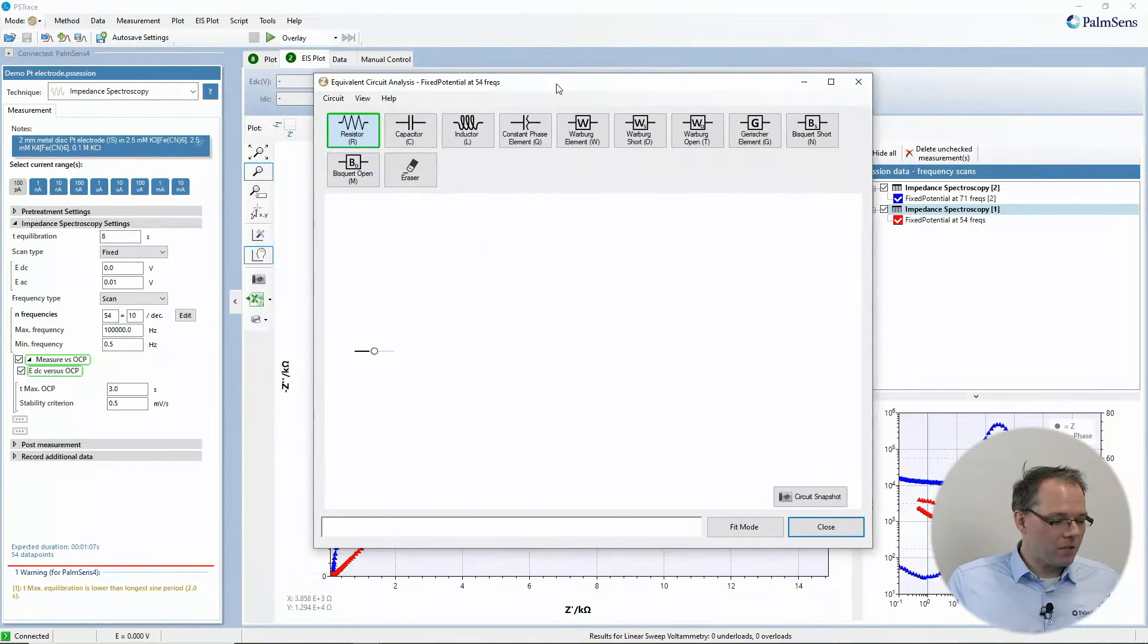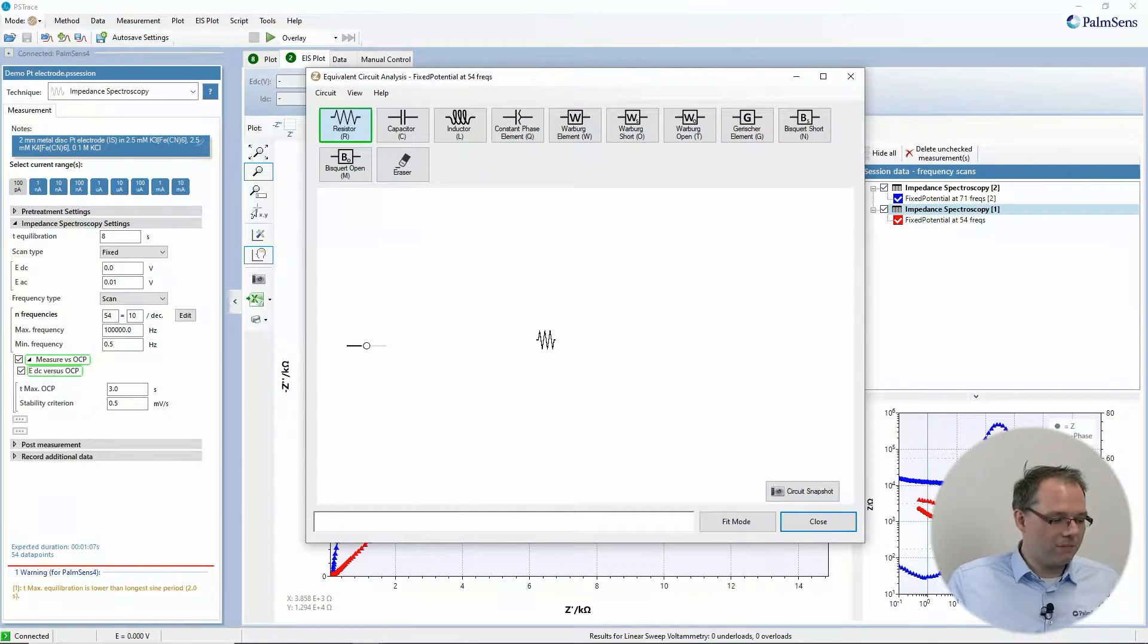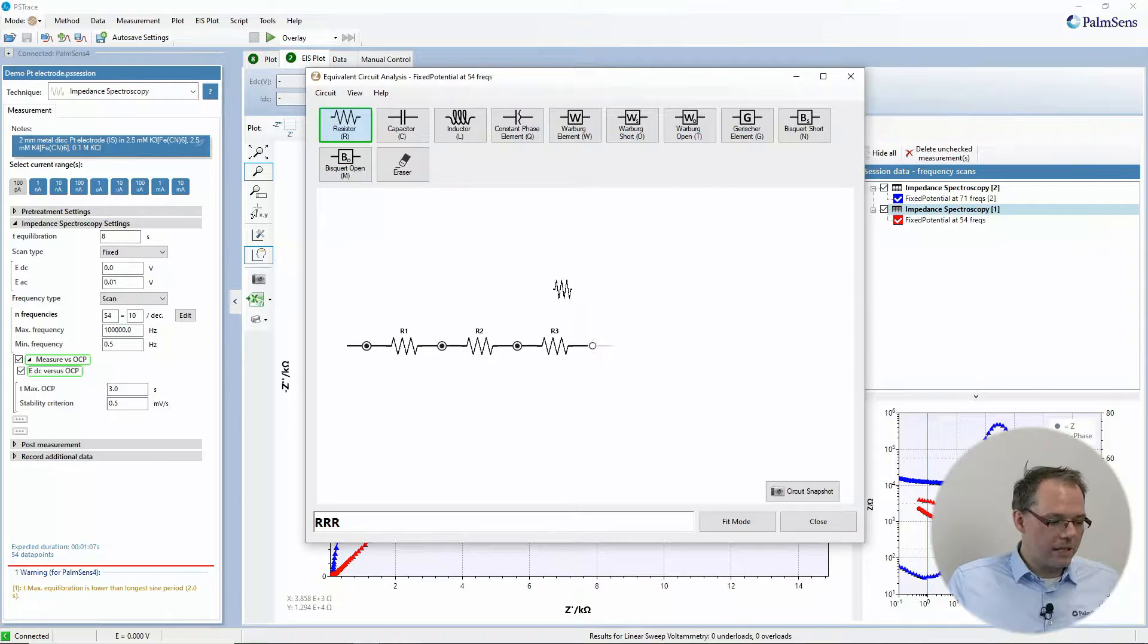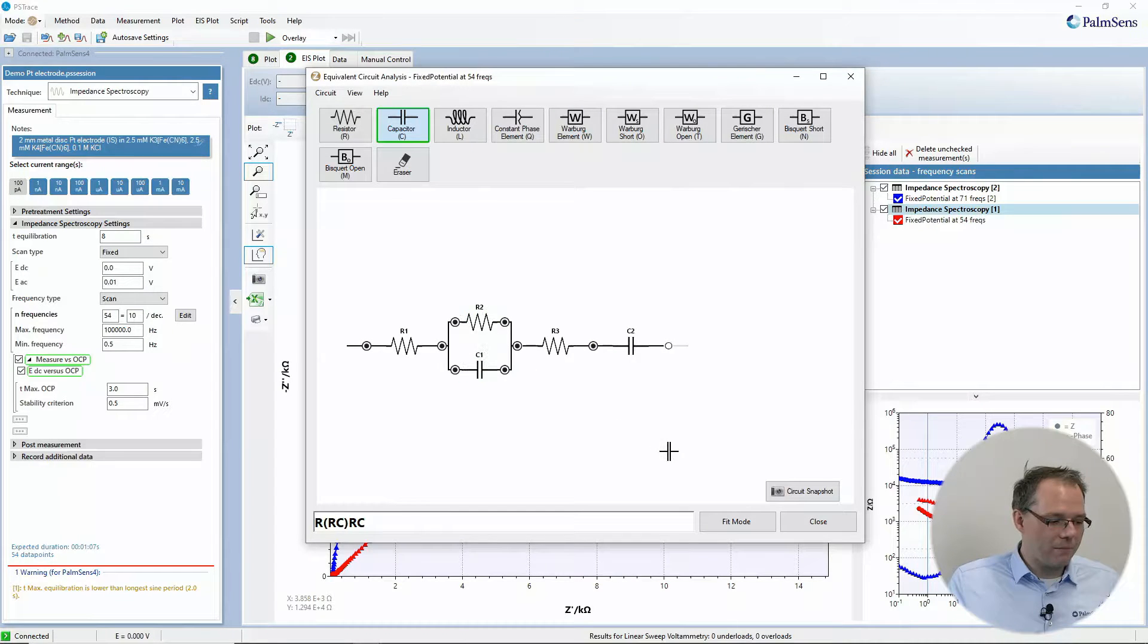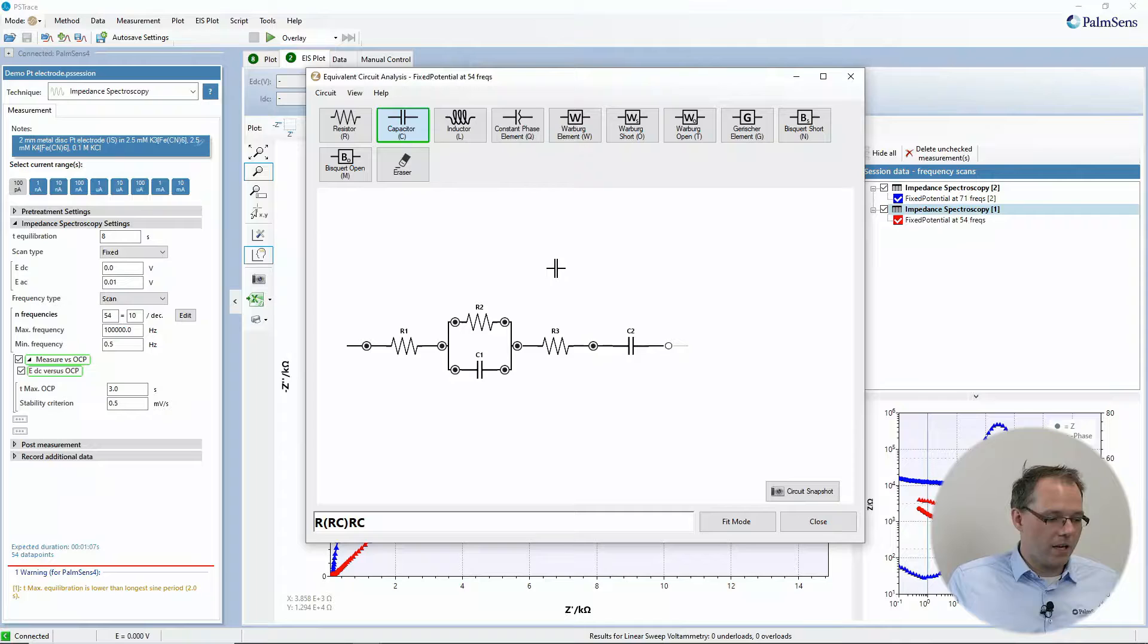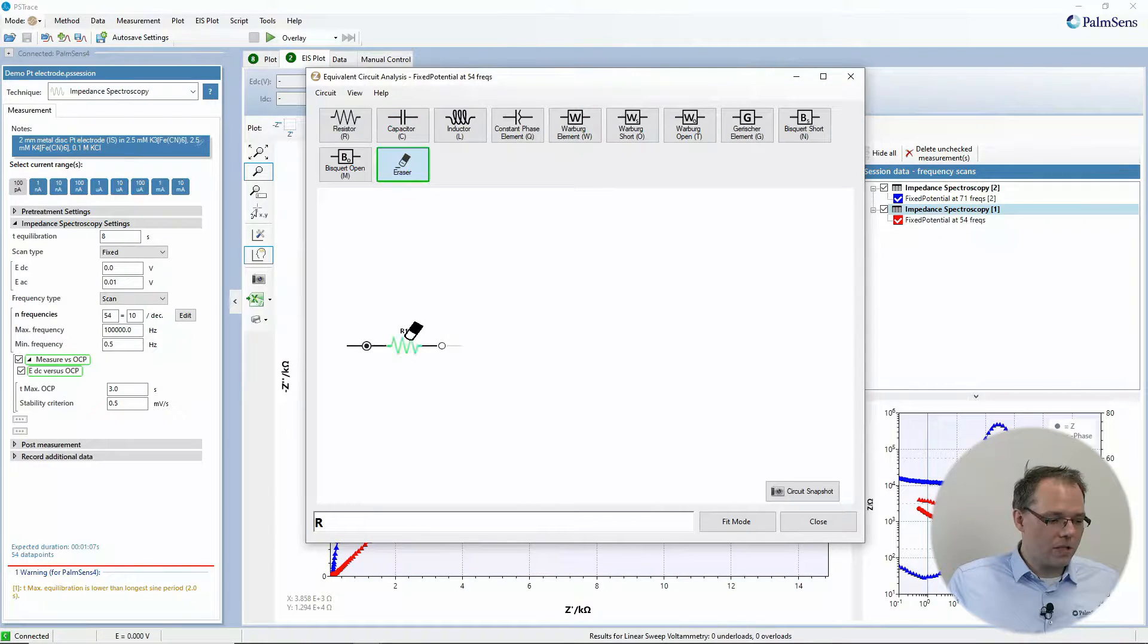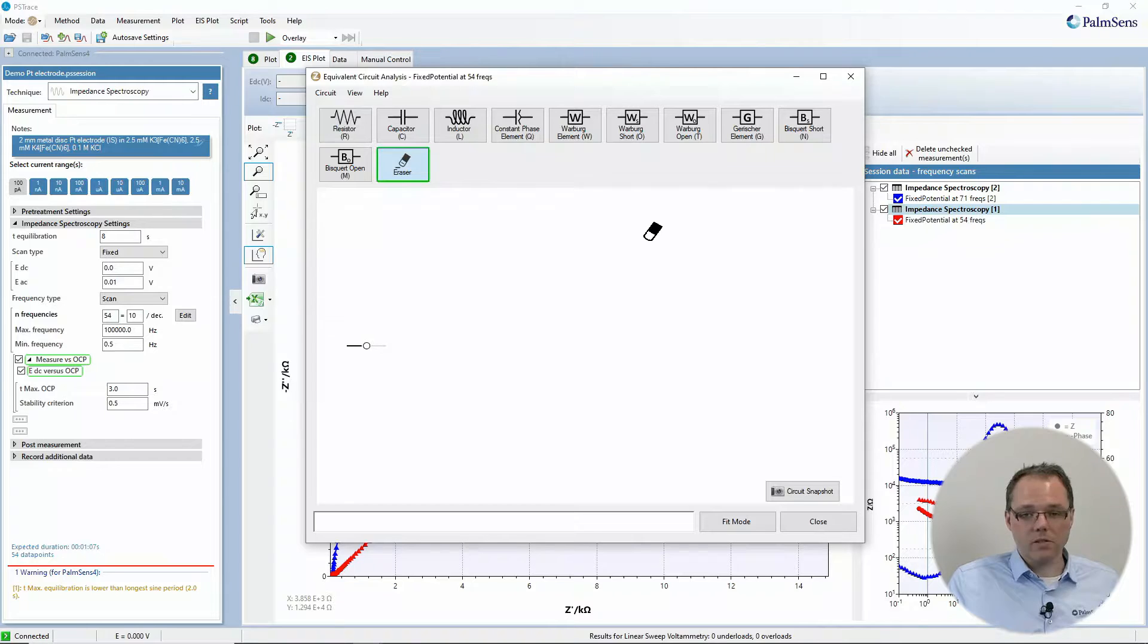When you click that button you will immediately get into the editor mode. And here you can draw your own circuit that you would like to use. Just click on one of the connection points to add another element, or if you hover above an element you would create something in parallel to it. If you want to get rid of something just use the eraser. We're equipped with all the standard elements that are used for equivalent circuit fitting.